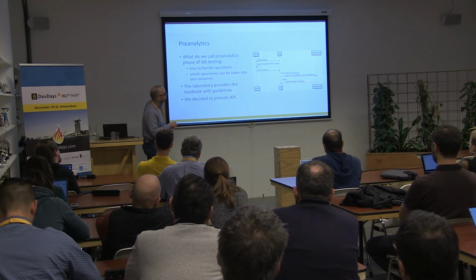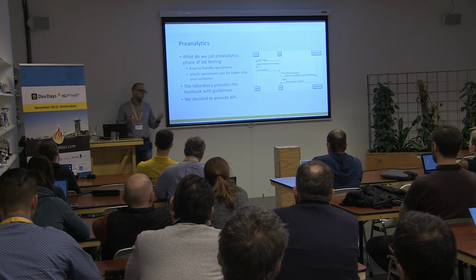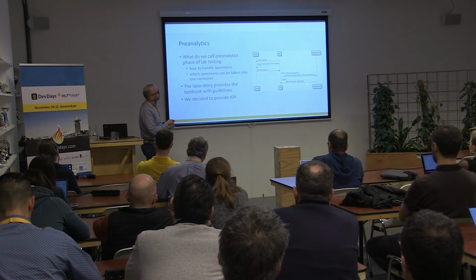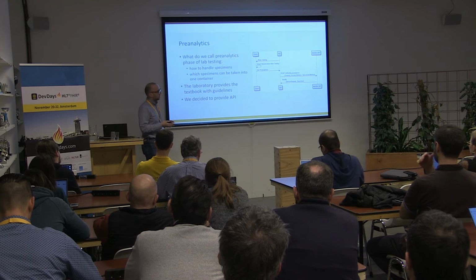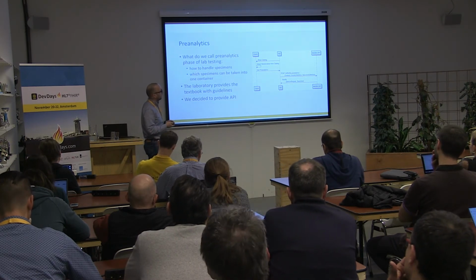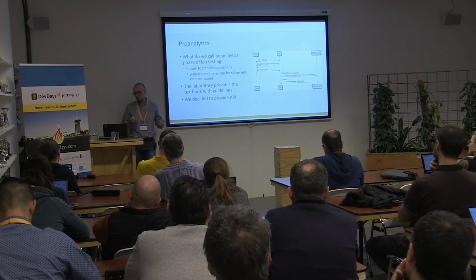There's some issue with specimen because we don't have any type of status for specimen, like draft or proposed, and the status field is required. So we use active or something like that. It's not really good, but there's no other way to do it. Okay.